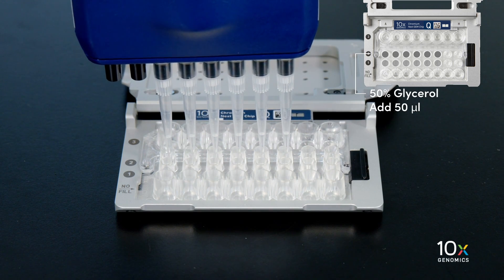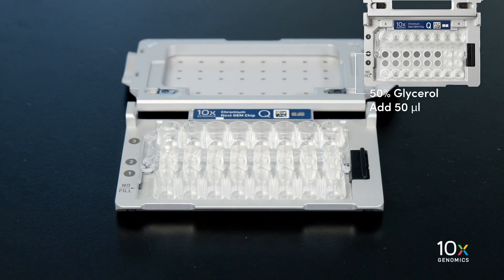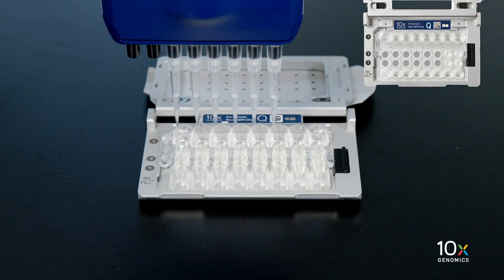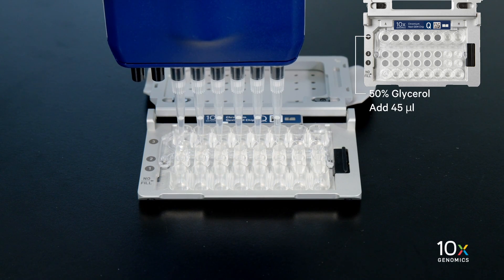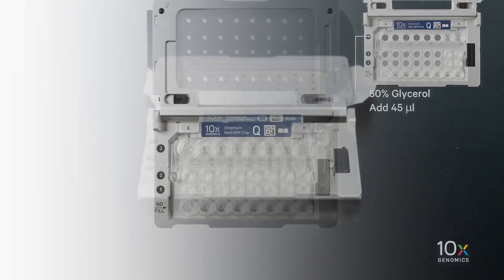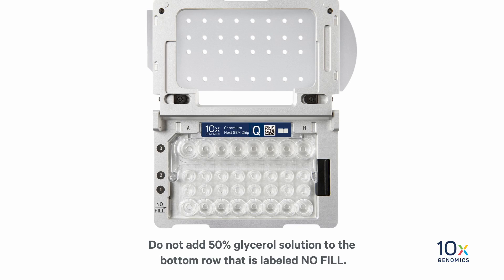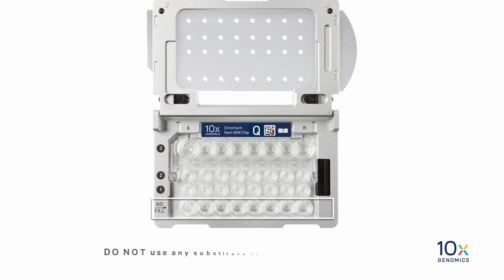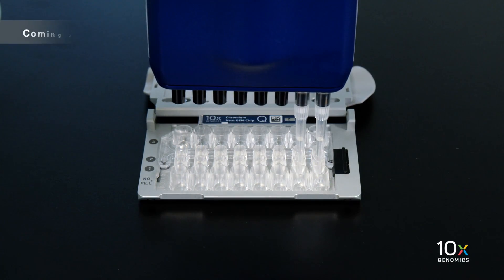Finally we will add 45 microliters of 50% glycerol to the unused wells in the row labeled three. Do not add 50% glycerol solution to the bottom row that is labeled no fill. Do not use any substitute for the 50% glycerol solution. We have completed chip assembly.